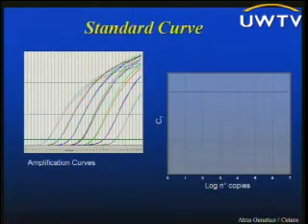And essentially what you're looking at is CT values or cycle thresholds, which is the cycle at which the fluorescence crosses the background threshold. In this case, the background would be this green line. So anything below this is considered background fluorescence. If it crosses the green line, then it becomes fluorescence that's real. And so here's a standard curve with different dilutions of a DNA sample, this being the most concentrated, so it crosses the threshold at the lowest cycle number, this being the least concentrated, so it's crossing the threshold at a cycle number of 32.